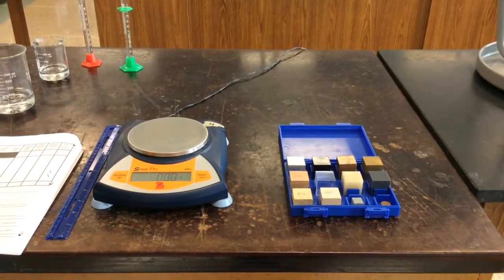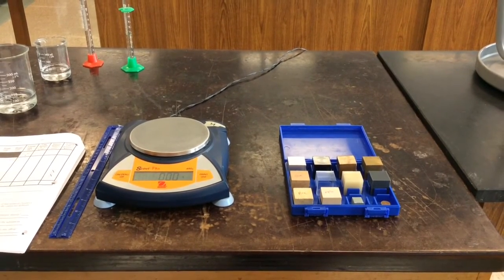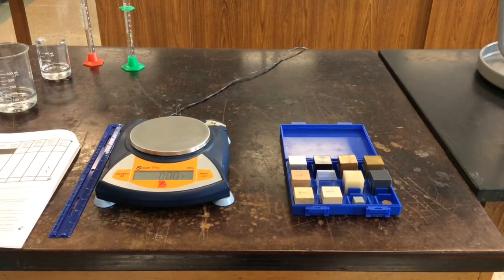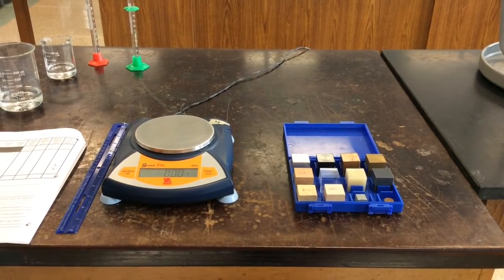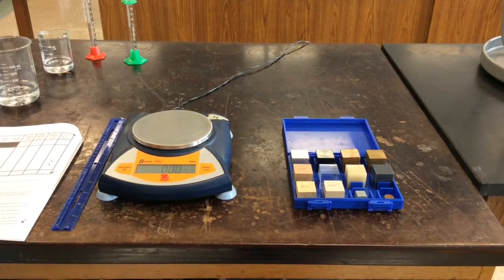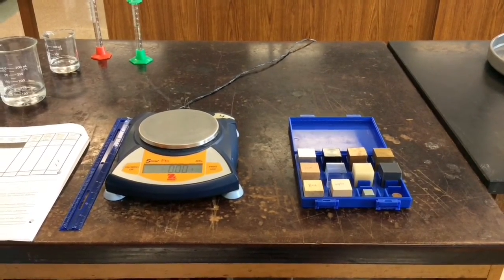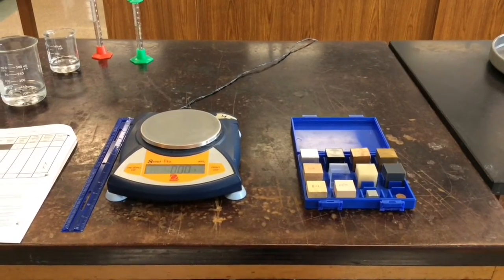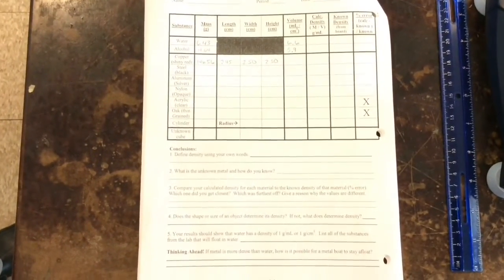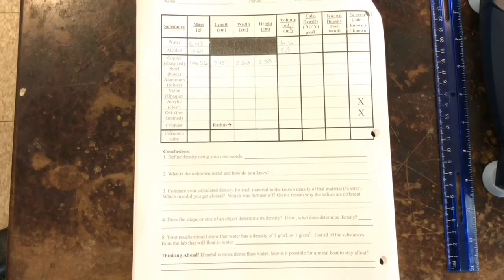After you've gathered the data, you can go ahead and calculate all the densities. Once you're finished doing that, your teacher will supply you with a list of the known densities for these items, and you're going to do a percent error calculation. Once you've finished with the percent error calculations, there are a number of conclusion questions that you can do. Please make sure that you answer all of the conclusion questions in full sentences. In addition, there's also a thinking ahead item. Make sure that you also answer that.